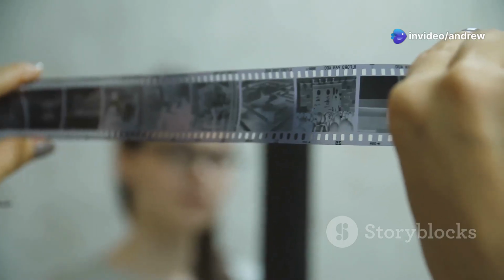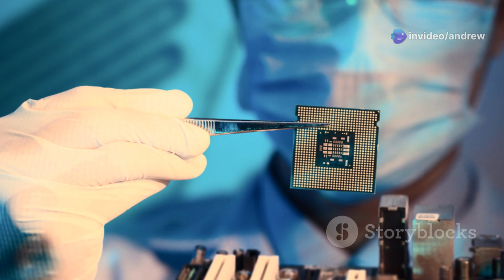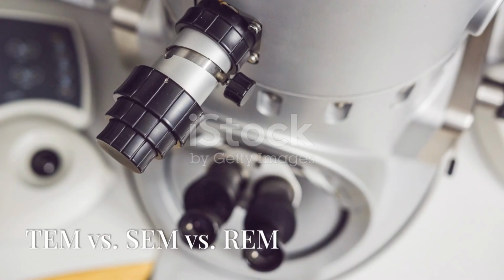This technique is particularly sensitive to the surface morphology and can reveal information about the atomic arrangement of the topmost layers of a material. REM is a powerful tool for studying surface phenomena such as crystal growth, surface reconstruction, and the formation of thin films. It is also used in the study of catalysts, semiconductors, and other materials where surface properties are critical.